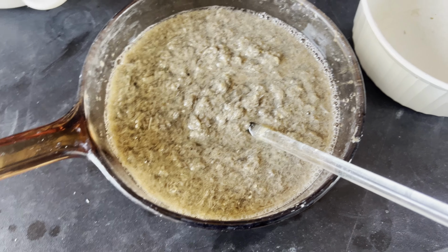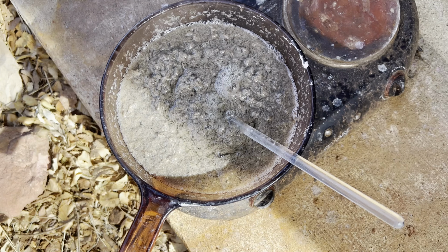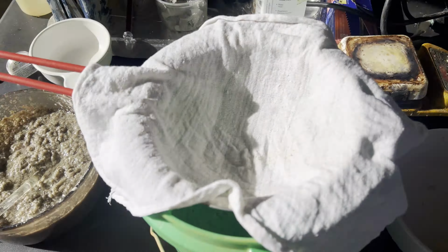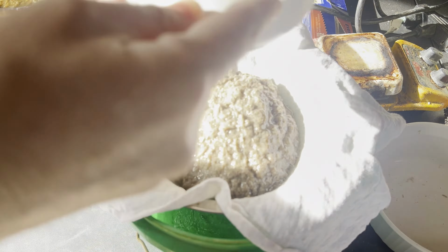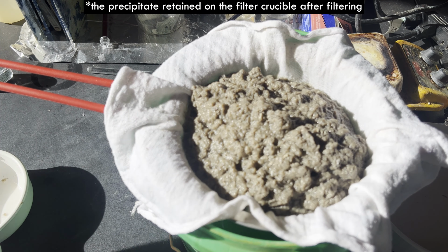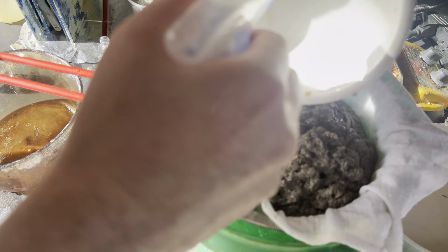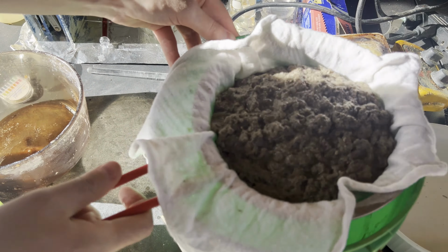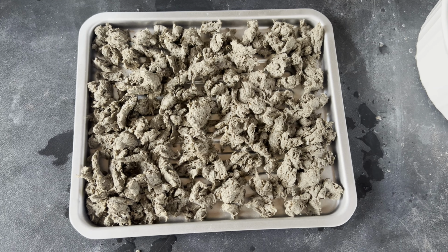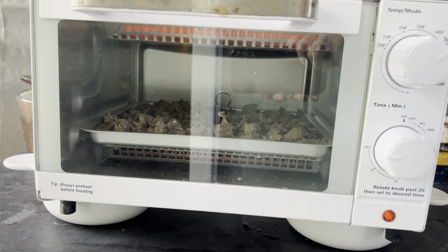I've read a lot of older chemistry and chemistry-related textbooks, and asbestos was used everywhere. It was especially useful in quantitative chemical analysis as a filtering medium. Where paper filters couldn't be used, like if the precipitate needed to be strongly heated in the crucible it was filtered through, or if the liquid was strongly acidic or basic, asbestos could be used. Its fibrous nature makes it an excellent filtering medium for extremely fine or even gelatinous precipitates. With the industry and technology available to us today, we can just make glass filter papers or sintered glass crucible funnels for the same purposes.